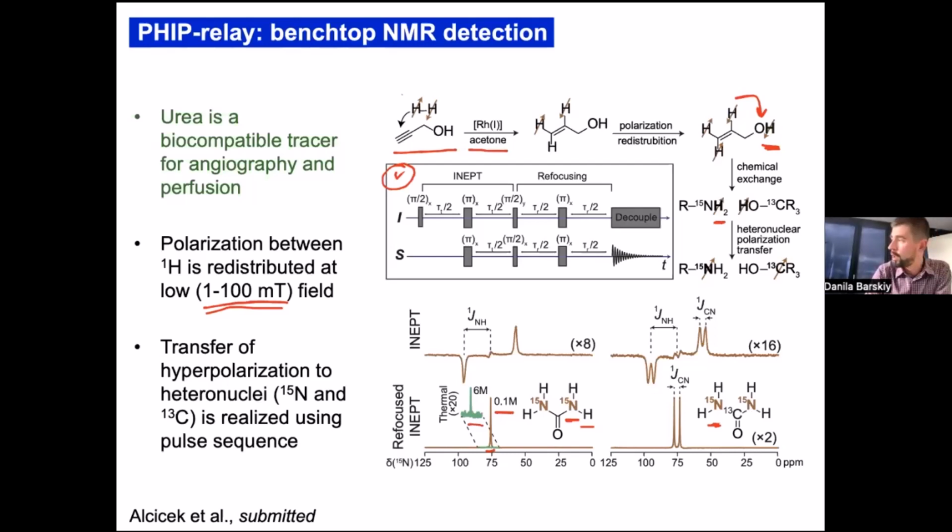So I don't know whether we can really compete at this moment with exact levels of polarization with the dissolution DNP. At the same time, we're not that far, and the technology to clean up solutions can be based on different principles. You can either precipitate your solution or use different solubility tricks with different solvents and salts. And I think it's just engineering. So you need to spend enough time as a team of good, experienced engineers to put things together. Other than that, there are no fundamental challenges.